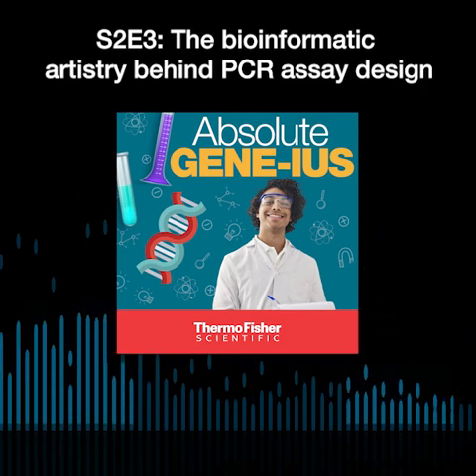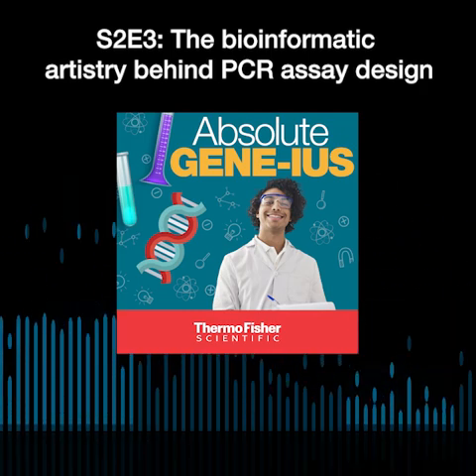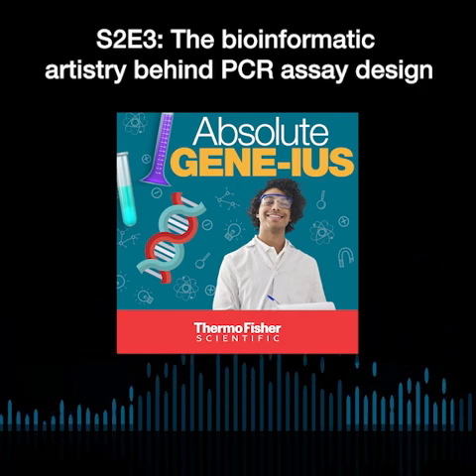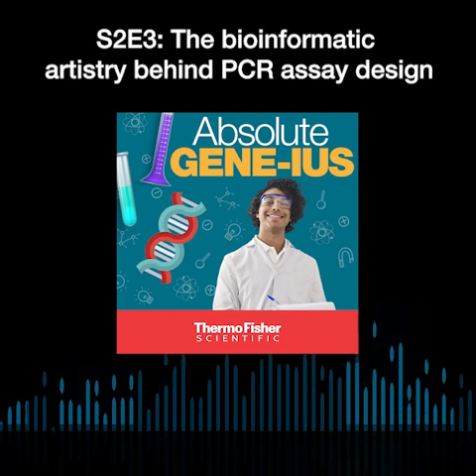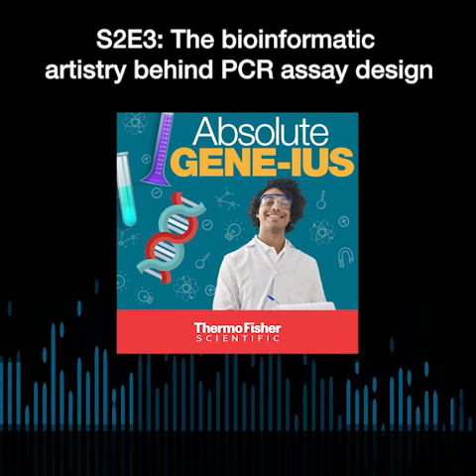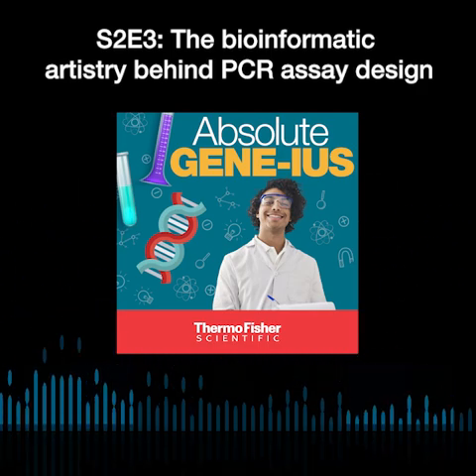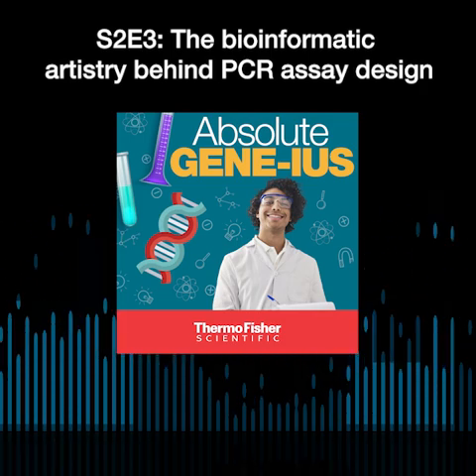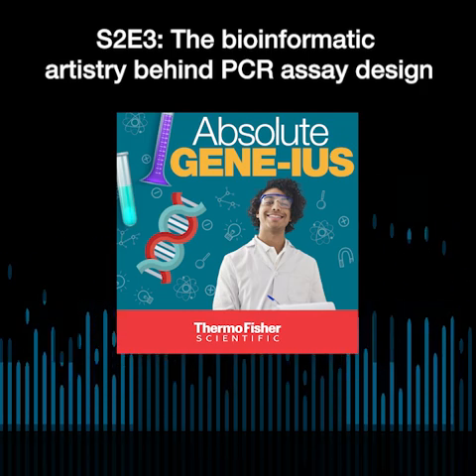Well, Kimi and Rounak, thank you so much for joining us today on Absolute Genius. We are very excited to have you. I'm really excited to dive into the world of digital PCR assays. I think it's a really cool conversation, and we absolutely love digital PCR here at Absolute Genius. So, one question I want to pose to both of you is, when you're looking at digital PCR and developing an assay for digital PCR, what are some of the key factors that researchers should consider?